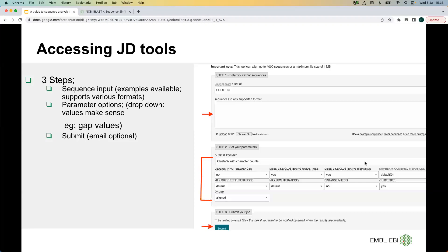For using a tool, you first need to provide the input sequences in a supported format. Pairwise alignment requires two sequences, while multiple sequence alignment tools require more than two sequences. Additionally, tools like MView that convert sequence formats require an alignment result as input. After that, you can set the tool parameters — click the 'More options' button to view all available parameters and select values that align with your requirements, or go with the default values. Then submit the form to launch the tool on our server.